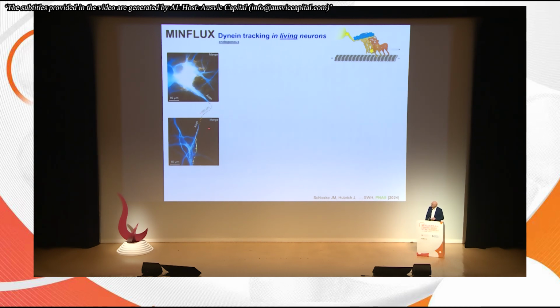And so the next step in the development was to really prove that we can follow the movement of a motor protein, in this case dynein, as it works in a cell. And there is no argument about whether this is physiological or not, because this is in a living cell. You have all the other proteins around and the right ATP concentration. And this has allowed us to see for the first time, to observe dyneins minimally invasively or basically non-invasively, just by following the fluorophores on the dynein.